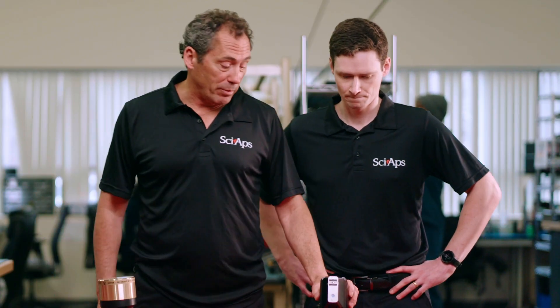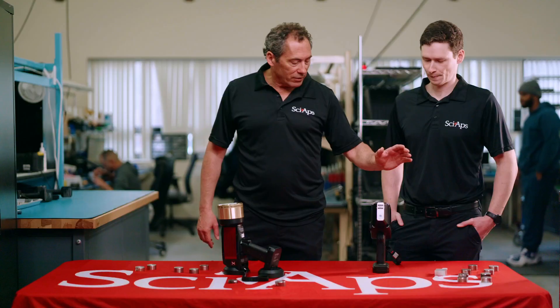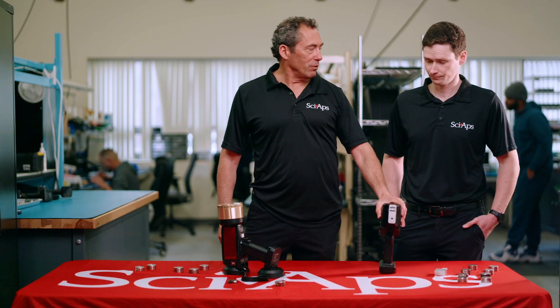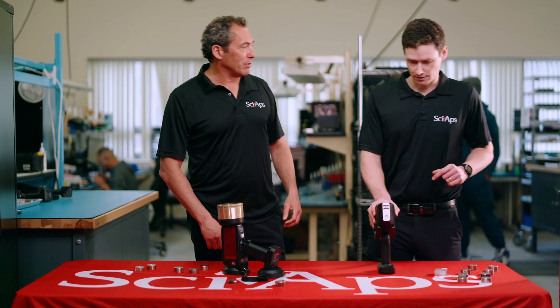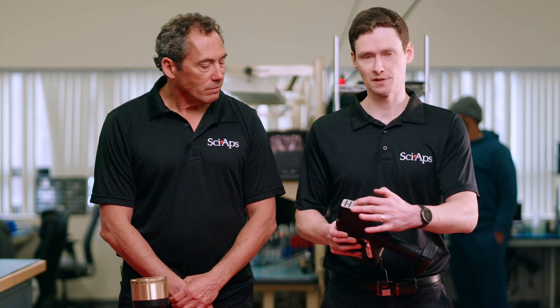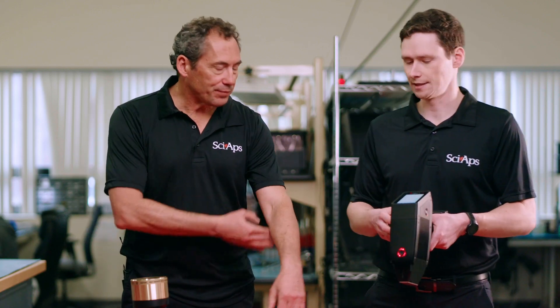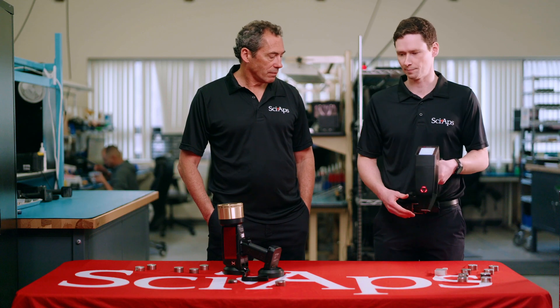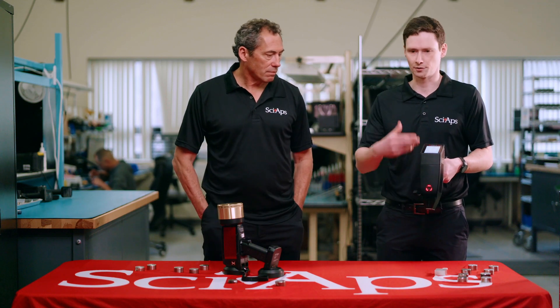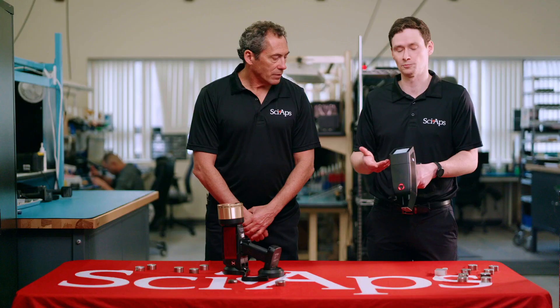We'll actually show something later which is our brines capability. The other source of lithium out there are brines — basically salt lakes with lithium. We use this device, but what do we do with it to make it analyze brine? It's pretty simple: you remove this wear plate, this front piece of metal — just two screws — replace it with a liquid plate, then drop it in the liquidator, which is like a benchtop docking station. It's only about ten to fifteen pounds; you can set it up on the back of a pickup truck or in a lab, operate it through a computer, and in a couple of minutes transition time you're ready to take tests specifically on lithium brines.